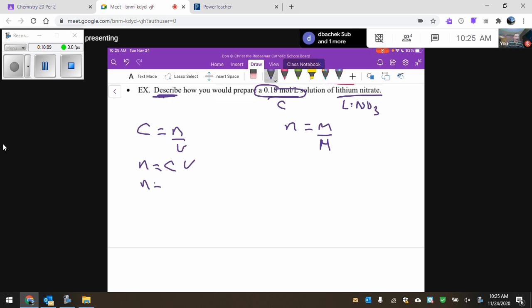Again, you might say, well, why is it 100? Because it's just right, okay? I tried to make a joke yesterday, but it doesn't really work. I'll do it again tomorrow, where I talk about Goldilocks and Baby Bear's bed, okay? It's just right. It's the right size, okay? It's not too much. It's not too little. It's the perfect size. I'll show you the 1 liter one tomorrow. It's quite a big flask, okay? It's a lot of solution.